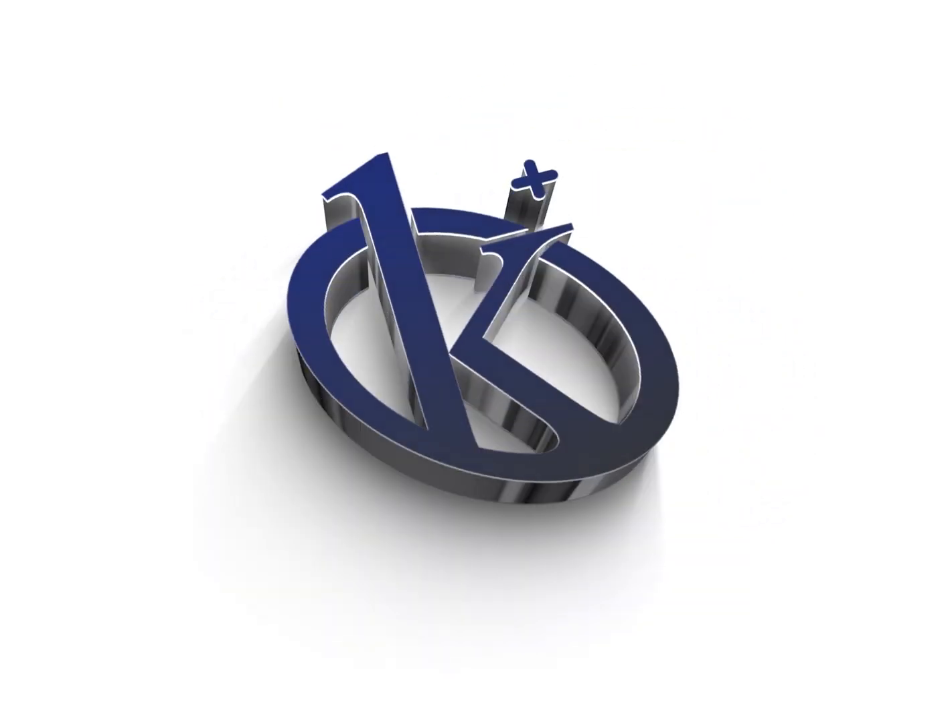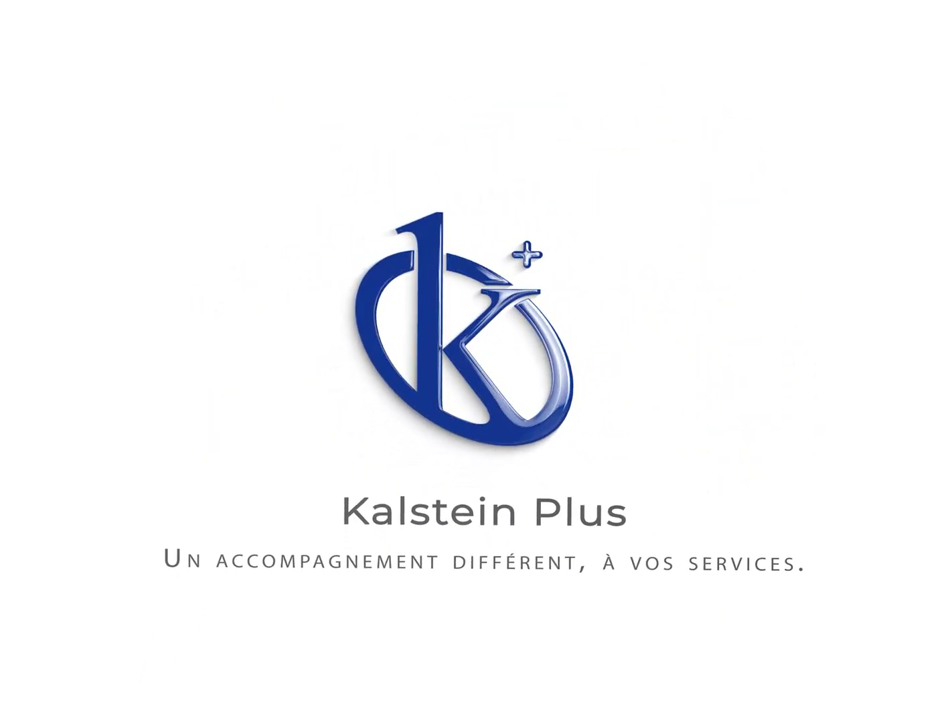We present you the model of Horizontal Autoclave Vertical Sliding Door Series Year 05647.